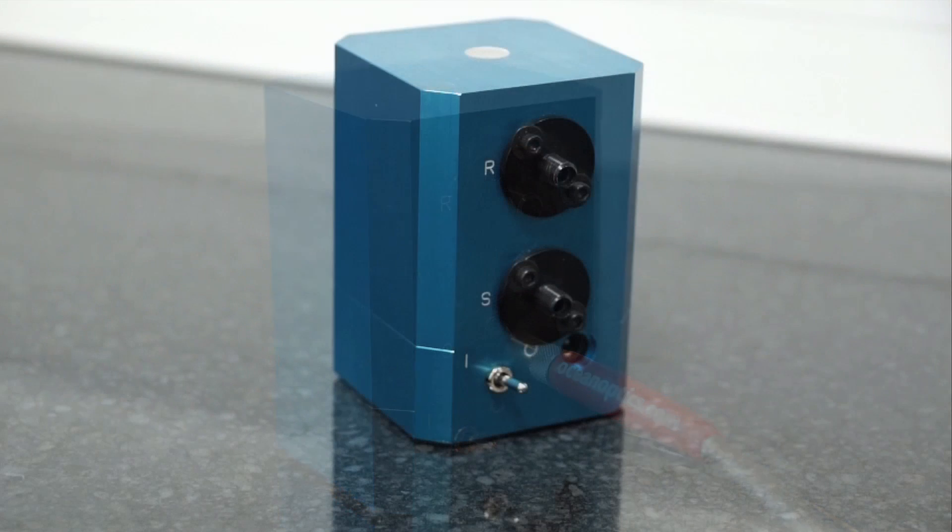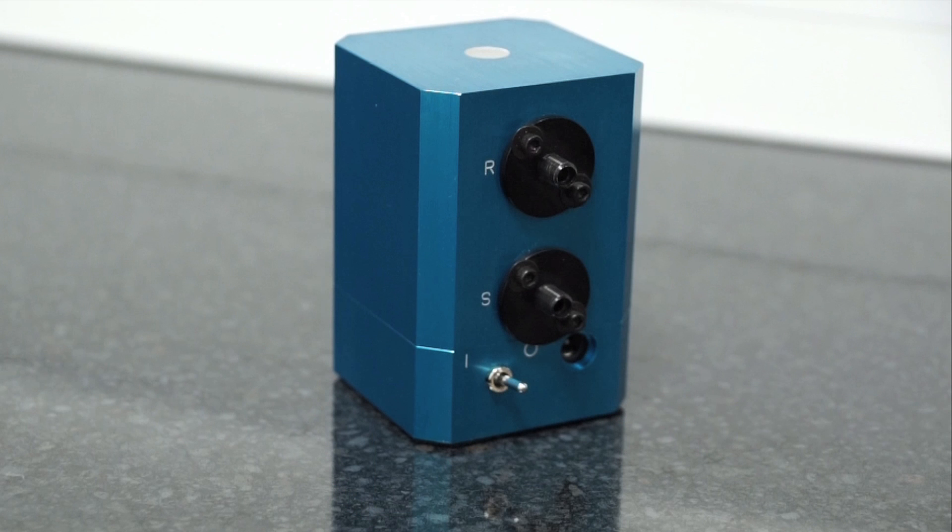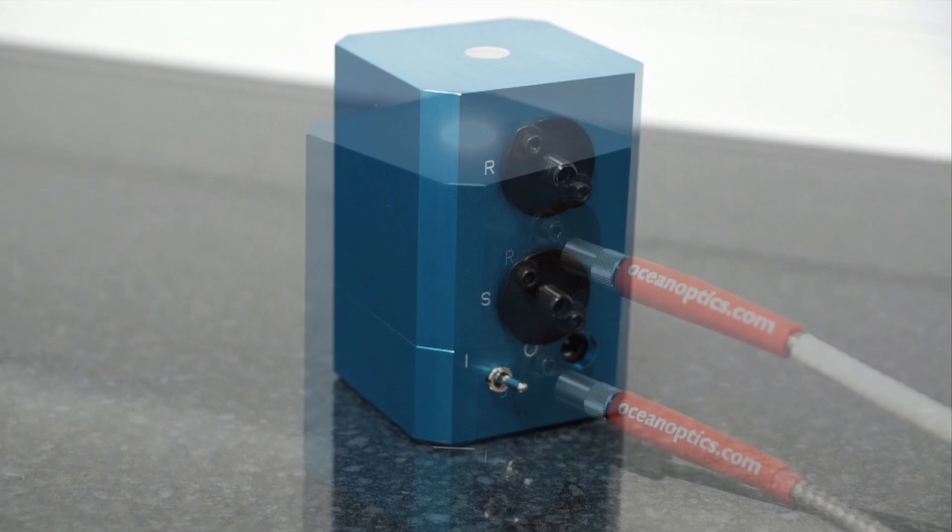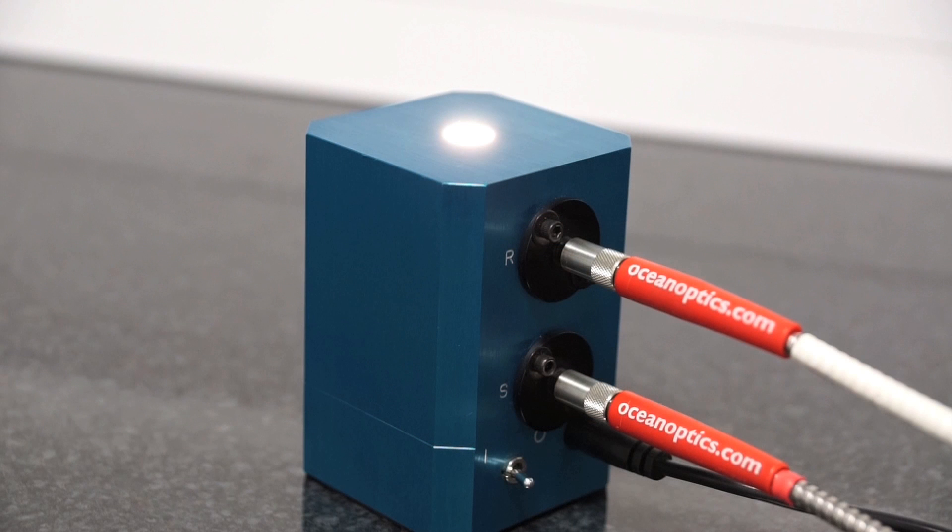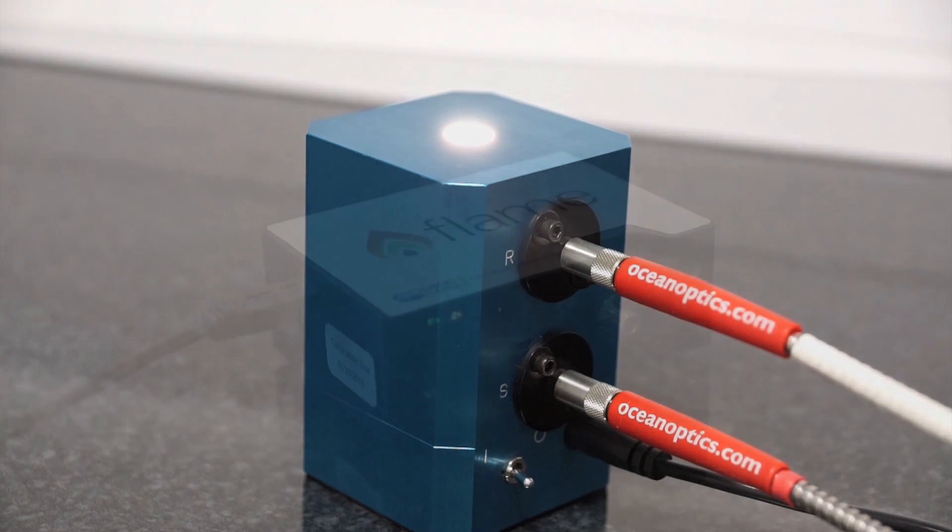You can collect either through the 8 degree S port or through the R port. R stands for reference, and this port can also be used to couple an optical fiber to a second channel in the spectrometer. This channel can then be used to monitor the stability of the internal light source.